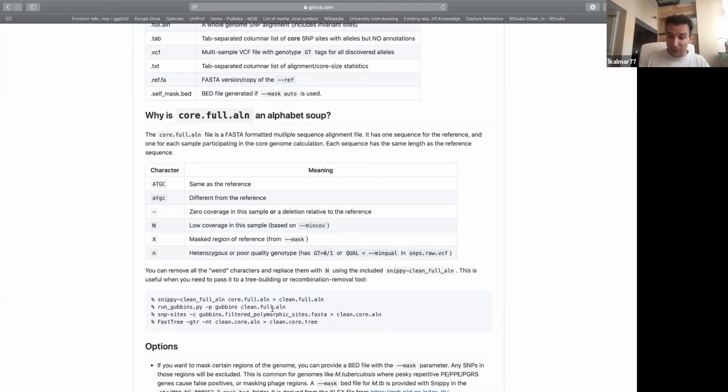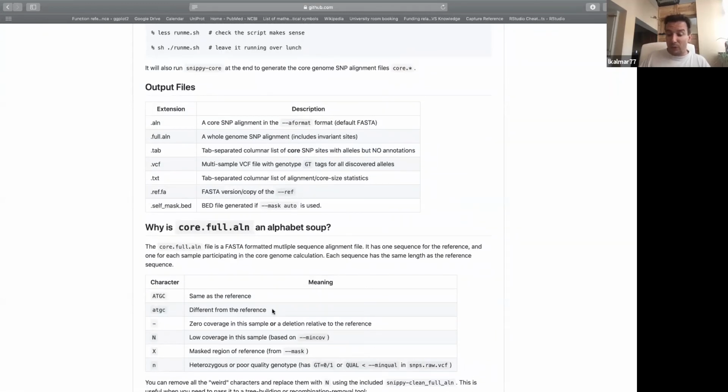There is a lot of chance to have different plasmids or even different gene sets within the genome between these isolates. If you are using a single reference genome, which you have to use for SNP, then you will only find out the differences compared to that reference genome. So you can use, of course, a known Salmonella reference genome and align all of your isolates, but the only thing you will find out is how the aligning parts of your genomes are different.